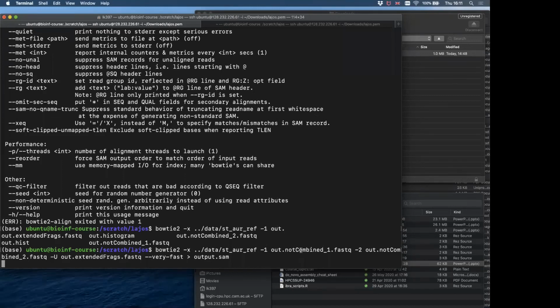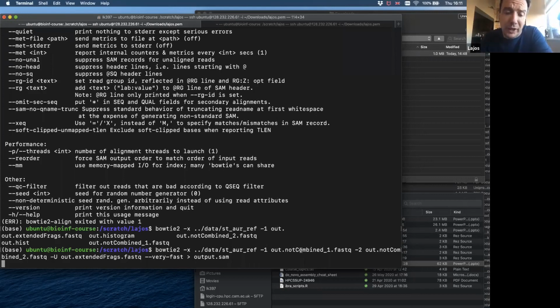So how about doing it the other way round, like you do the alignment and then merge the two paired-end sequences? Yeah, that's why you don't really have to do the merge. For the realignment, it's not as important, because you are just aligning them to a reference sequence. So it's completely okay if you do, for example, this alignment with not the flash output, but those files which we used before we ran the flash.